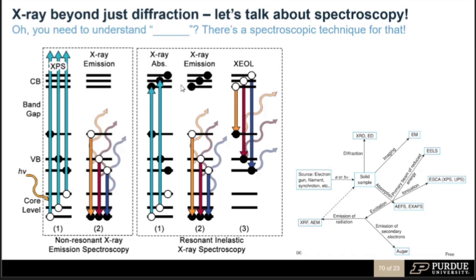We also do X-ray absorption spectroscopy. Instead of just exciting electrons and measuring what comes out to the vacuum, you're promoting electrons into unoccupied states. The number of electrons you get out of absorption, including the transmission yield, tells you a lot about the unoccupied states. What's cool about this is that by combining X-ray emission and X-ray absorption, you can simultaneously probe both the occupied and the unoccupied states. And so the draw to that would be the development of connections to the first part of the talk.